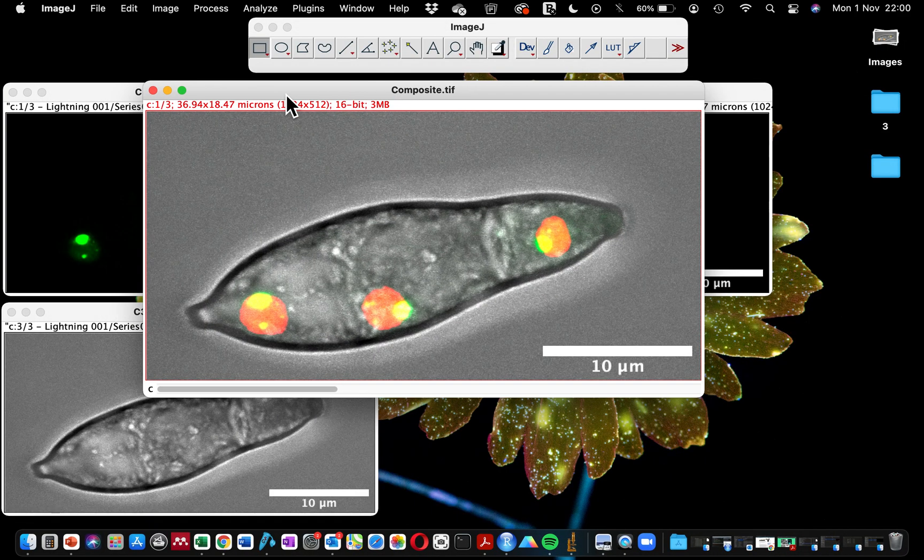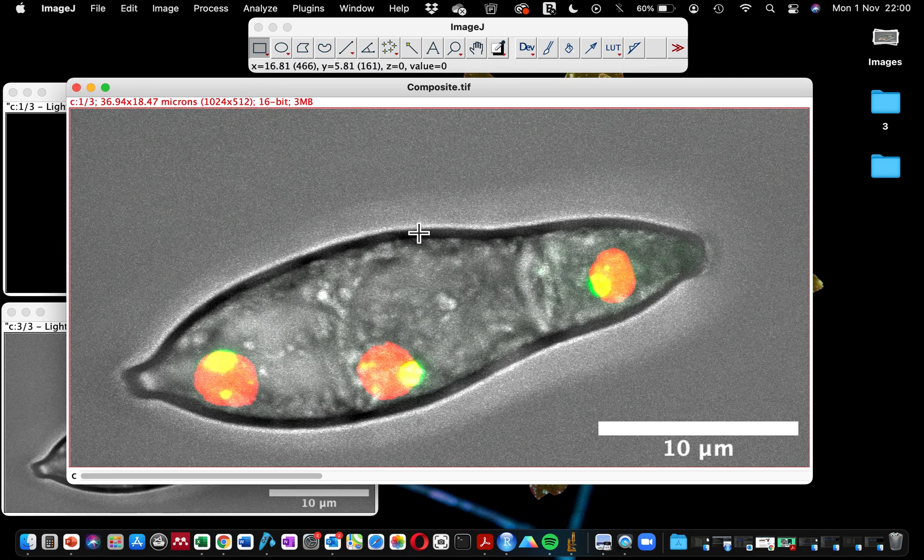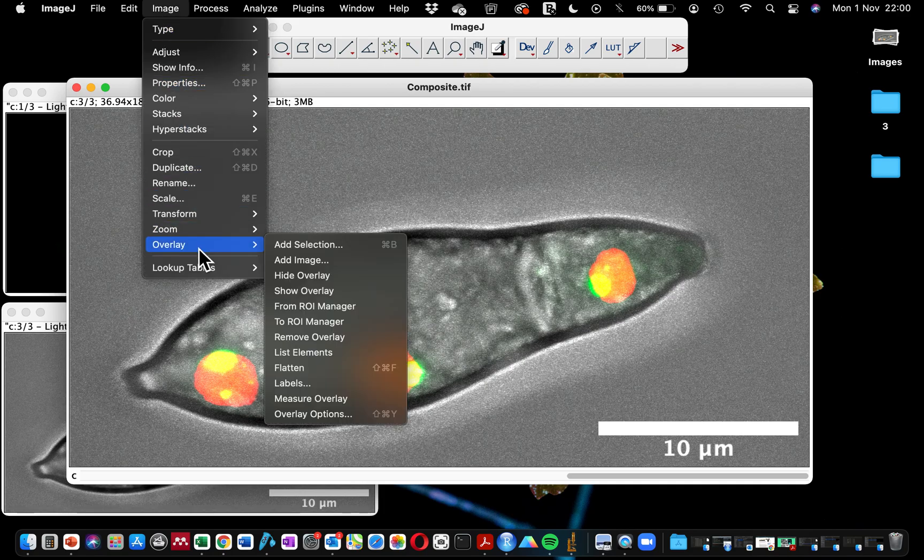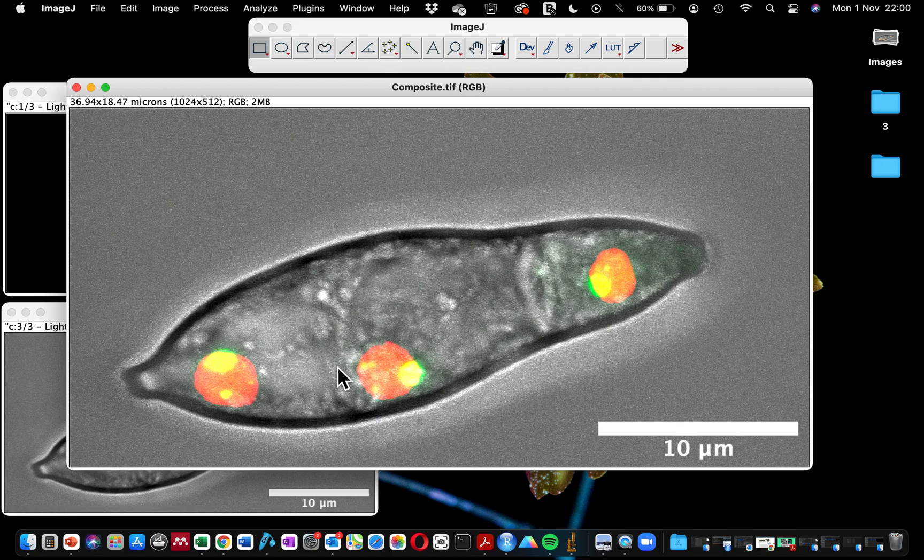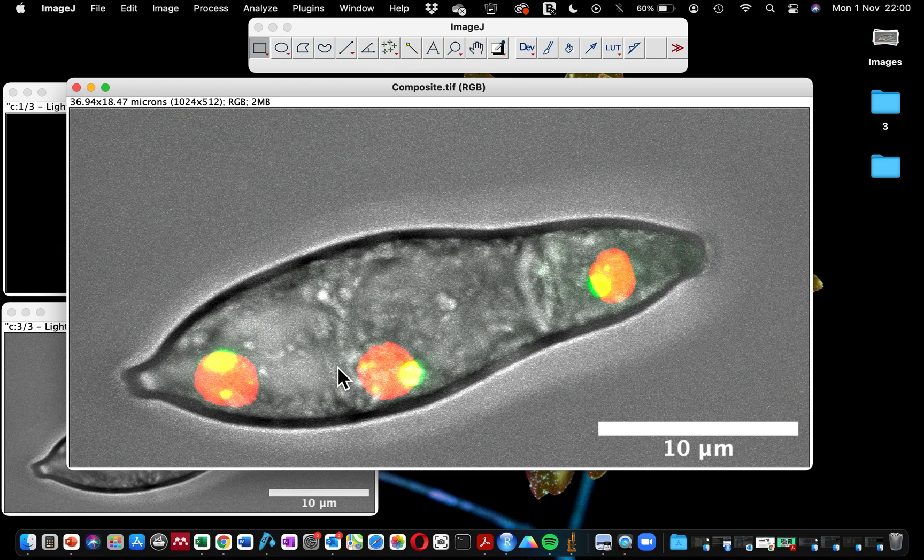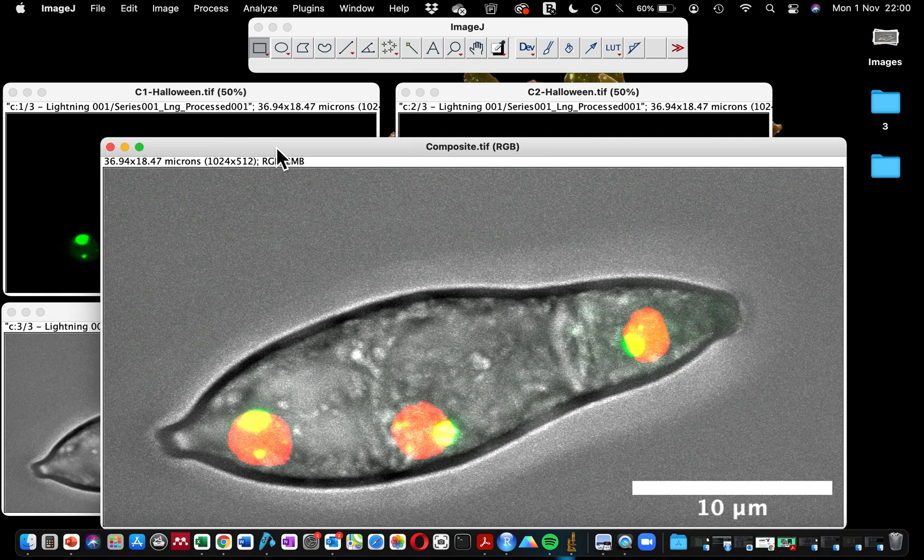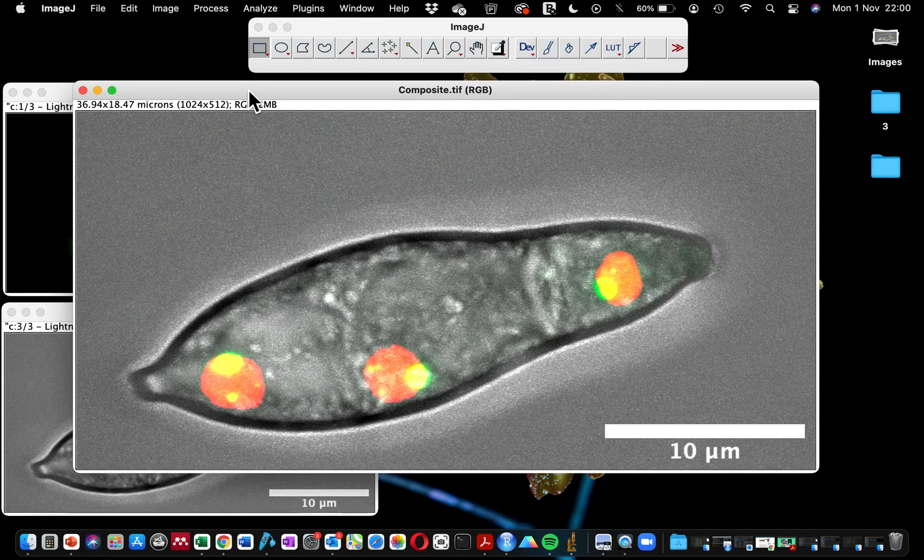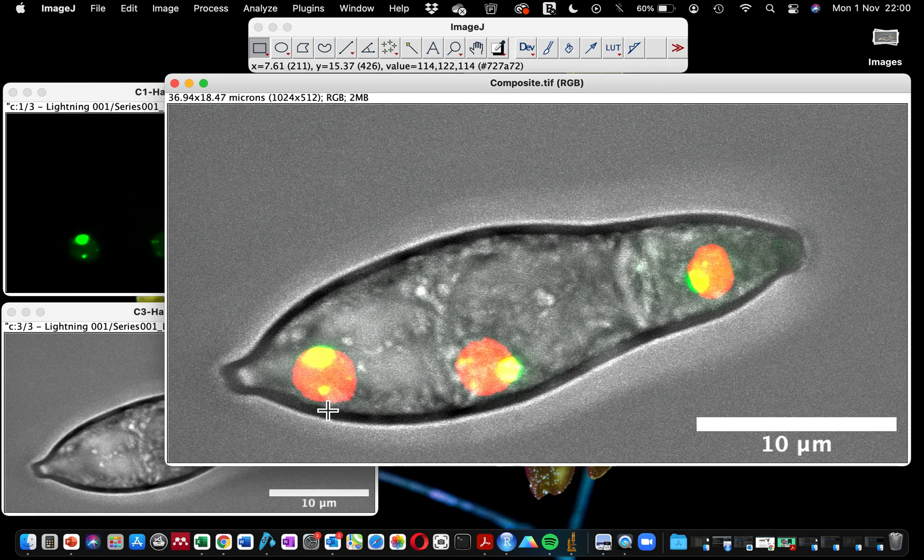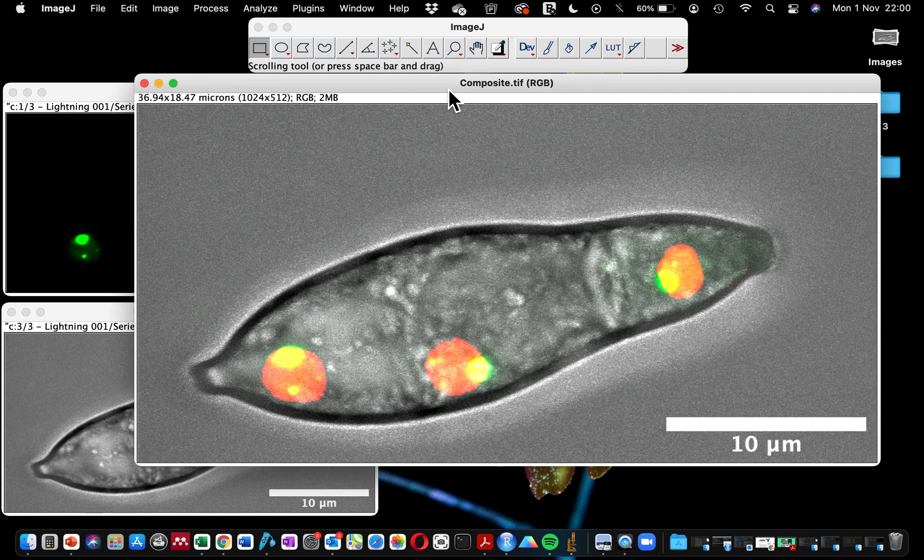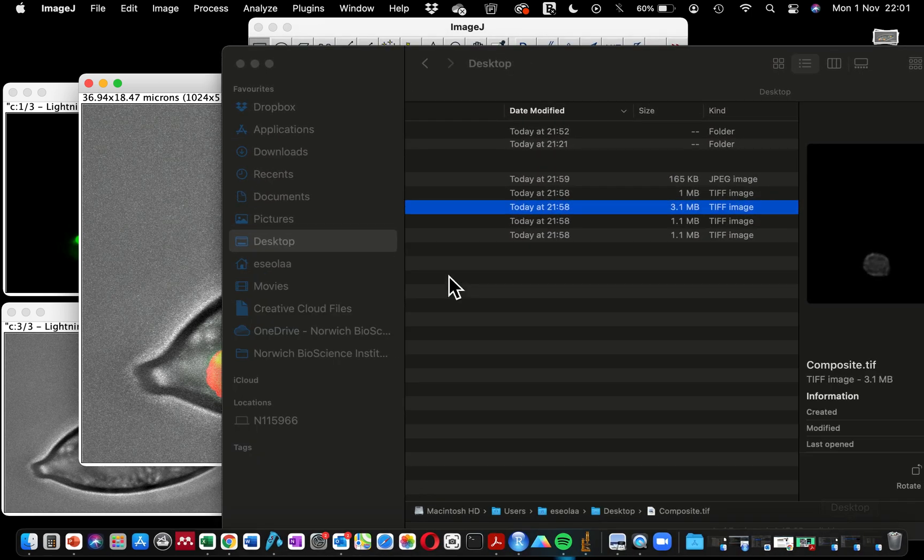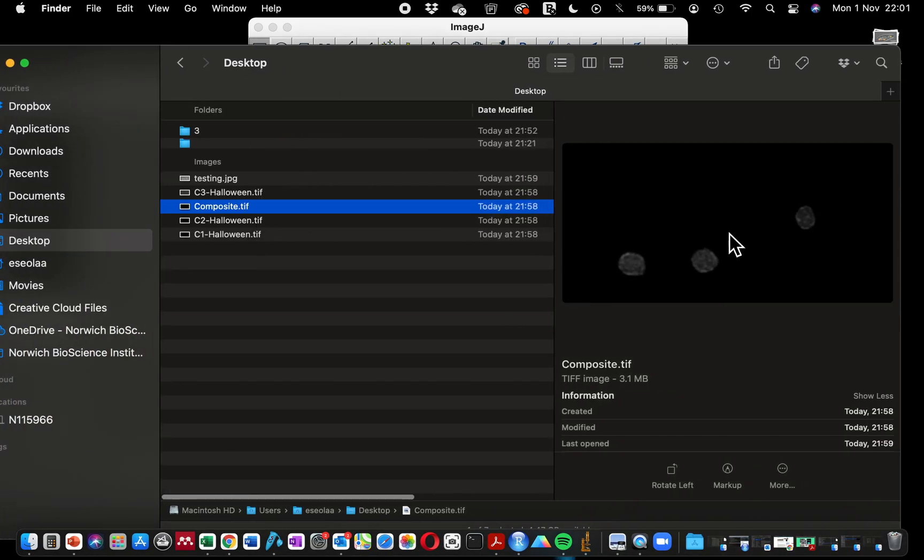Now I'm going to quickly show you the solution as promised. To rectify the problem of the scale bar disappearing after saving as TIFF, you have to go to Image, Overlay, and click on Flatten. Can you see that when I click on Flatten, ImageJ combined every information on the image into a single file, into a single image? So the sample that was showing as composite with the different channels showing separately when we clicked to open from the earlier saved version is now saved as a single image.